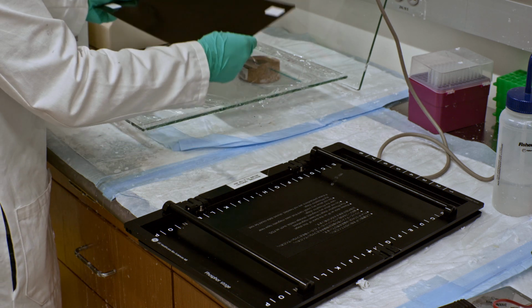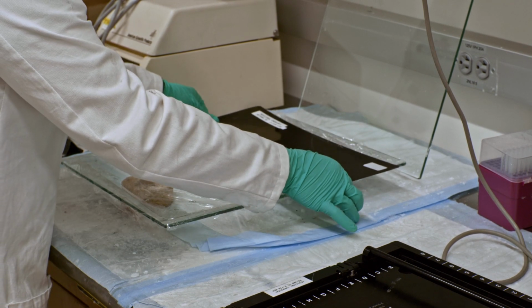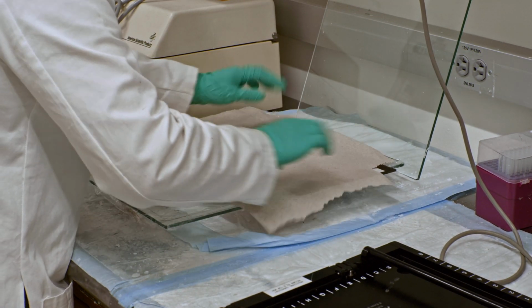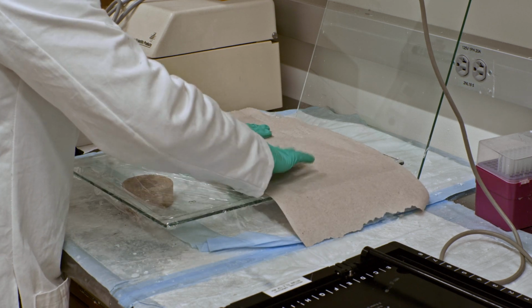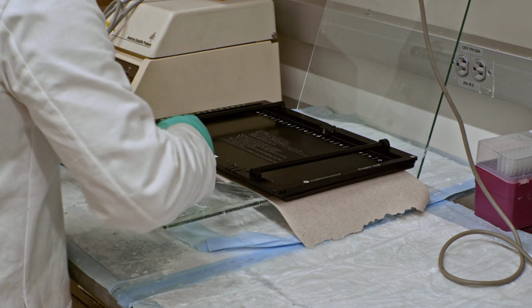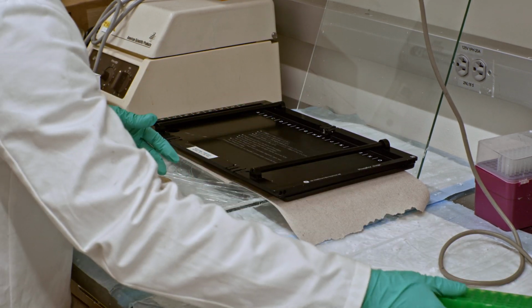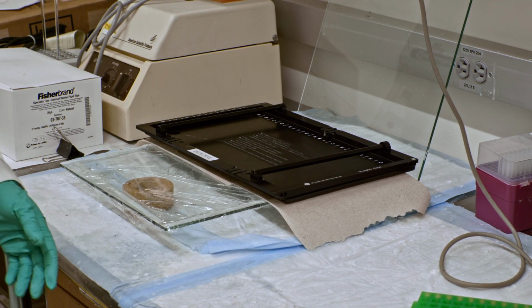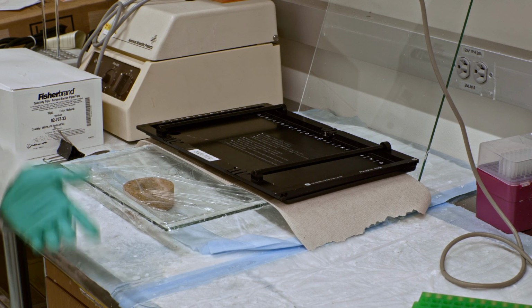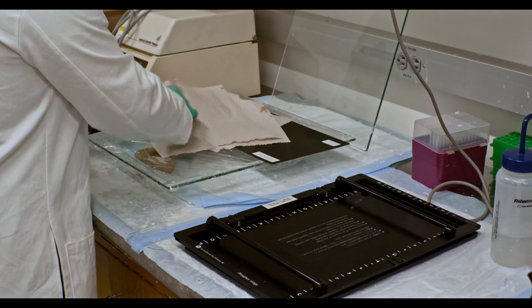We apply this film right on top. You try to pat it down as nicely as you can, and then put some paper towels just to keep it a little darker, and to then not allow the film to move, we like to put some weight on it. We use the cassette itself. You can use other things such as these microcentrifuge holders to put some weight on it, but then basically you're done. This film has to stay on top of this gel overnight, and then whenever you come back to lab the next day, just do the opposite, take off all the weight, and then put the film right back into its cassette.